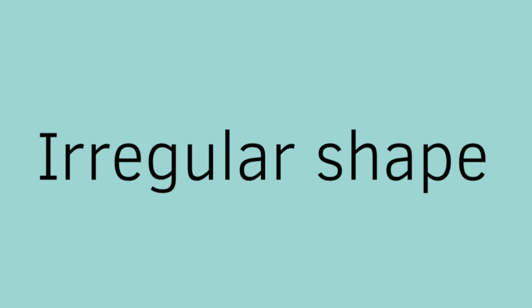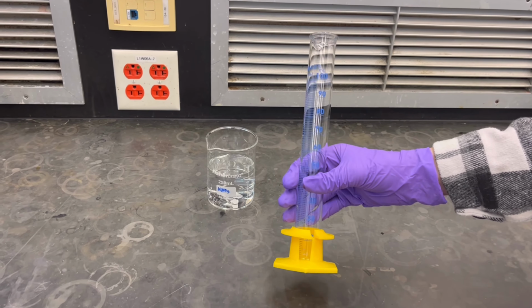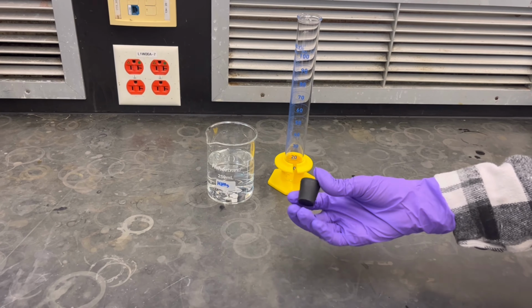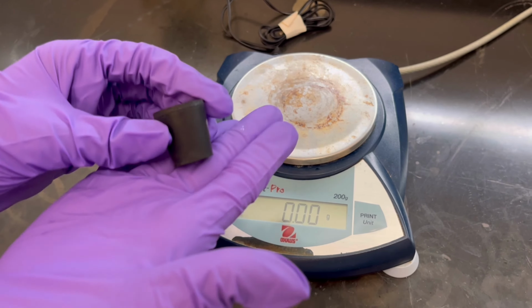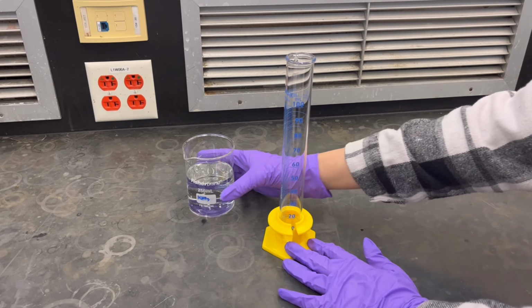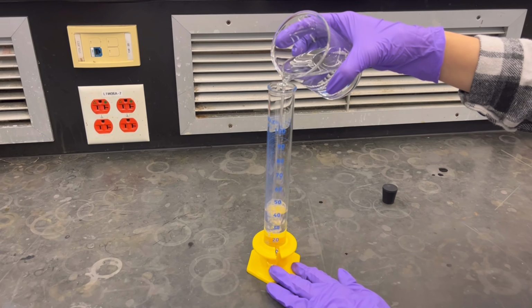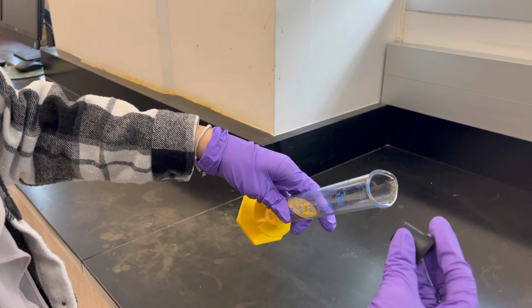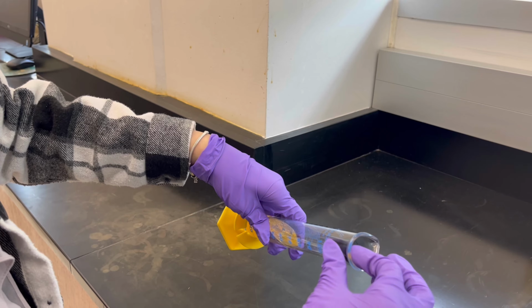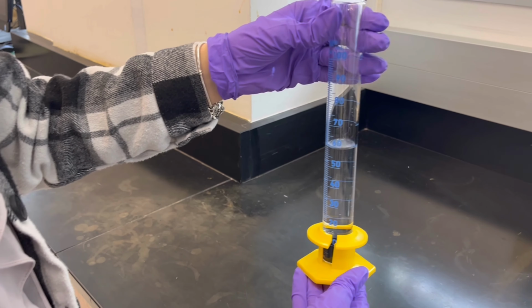Irregular shape. For this part, we will need the DI water from the part before, a 100 milliliter graduated cylinder, and a stopper. Going back to our balance, we're going to measure the mass of our stopper. Now getting our 100 milliliter graduated cylinder, we're going to fill it with 50 milliliters of water, then record the volume of the water. Then bringing our stopper, we will slide it in carefully so it doesn't hit the bottom of the cylinder and break the cylinder, and then we're going to record our volume.